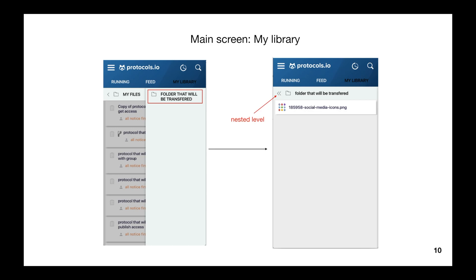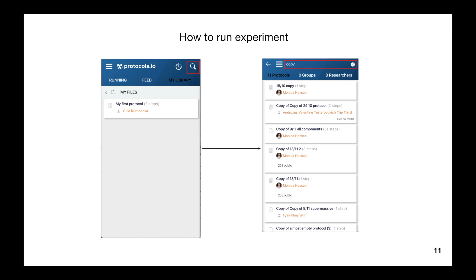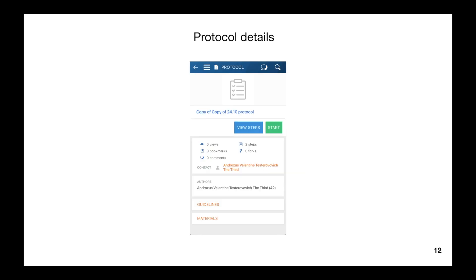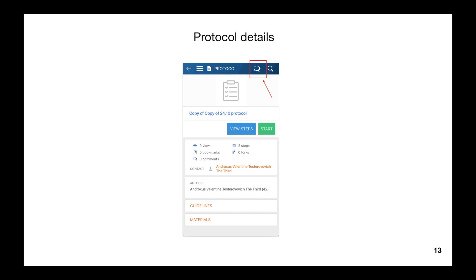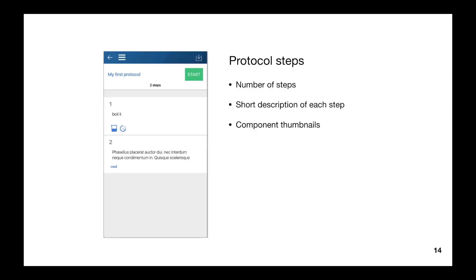Our main question for today is how to run and save experiments. Let's imagine you are a new user and you don't have any bookmarked protocols. You can search for what you're interested in by tapping the magnifier icon at the top right. Tap what you want to view and you will be taken to the protocol detail screen. It shows summary information, number of steps, contact information. You can also view protocol-level comments. The View Steps button opens a full list of steps with brief descriptions, including protocol title, number of steps, short description of each step, and component thumbnails.